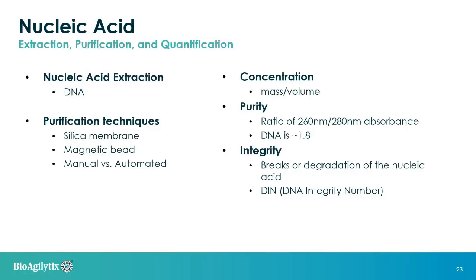So I'm briefly going to talk about the molecular workflow, regardless of the purpose, whether that's CMC or bioanalytical. When you have a molecular assay, the extraction of nucleic acid from the drug product or the patient sample is part of the method, and it can be performed with a variety of techniques, including isolation and purification with silica membranes or magnetic beads. These can be manual processes or automated, which are often nice to have with high throughput sample extractions.